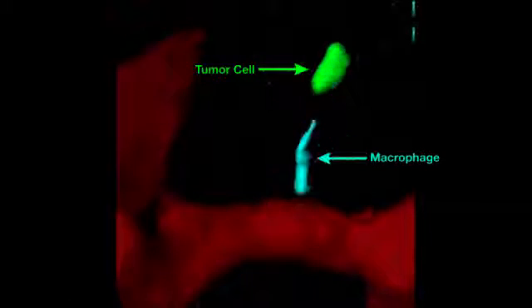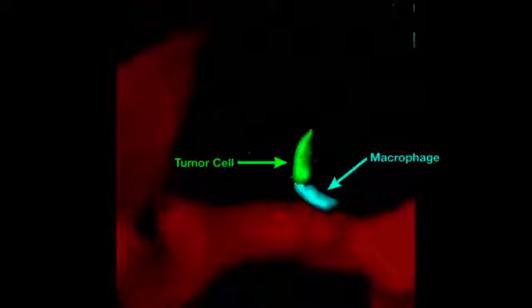This 3D reconstruction shows a cancer cell and a macrophage positioned in close contact to form the T-MEM portal or hole in the blood vessel, allowing tumor cells to pass through. This is the moment when the portal opens to allow the cancer cells to enter. The red explosion is blood squirting out of the vessel at the same moment as the tumor cells go in.